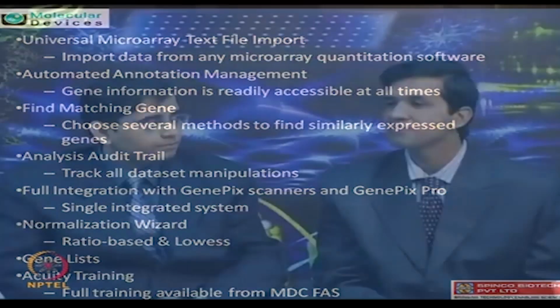Okay. So basically if I understand, it is coming from 532 or 635, telling that it is coming from this wavelength, and still you can do the statistics. Sure. So regardless of what platform is being used, it's just the wavelength and the text file which matters here. True. And we give training at different stages also, so that one can become friendly with the software.